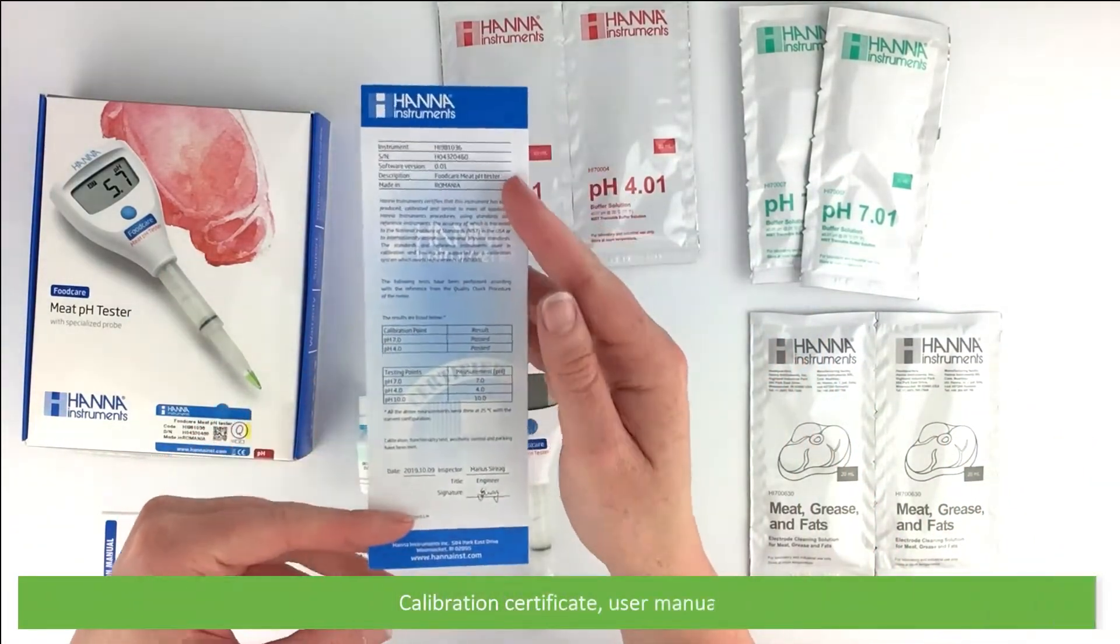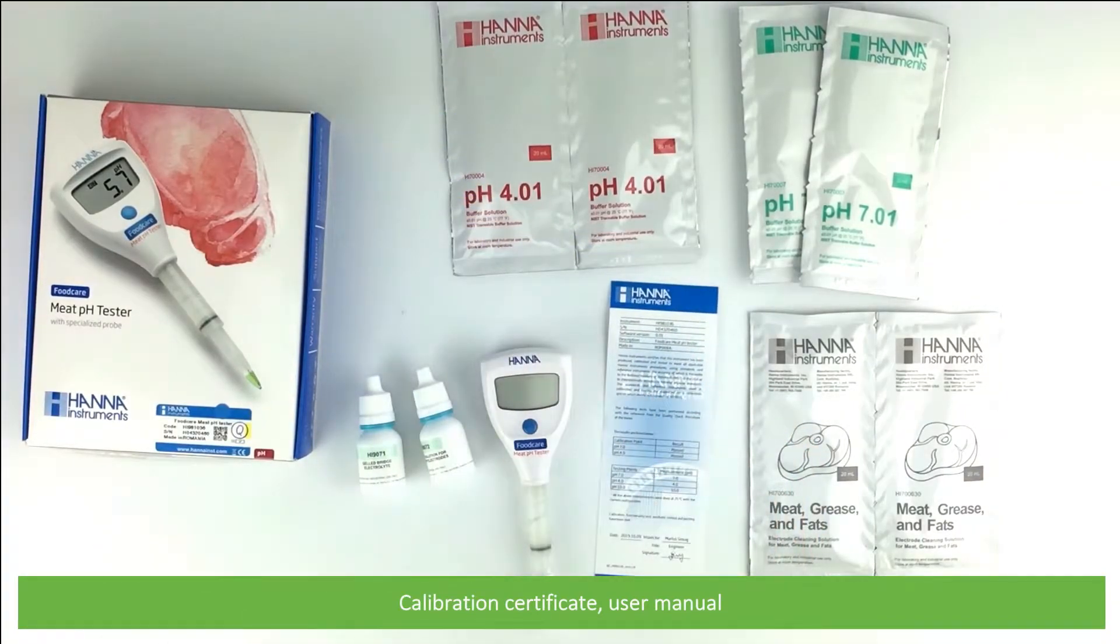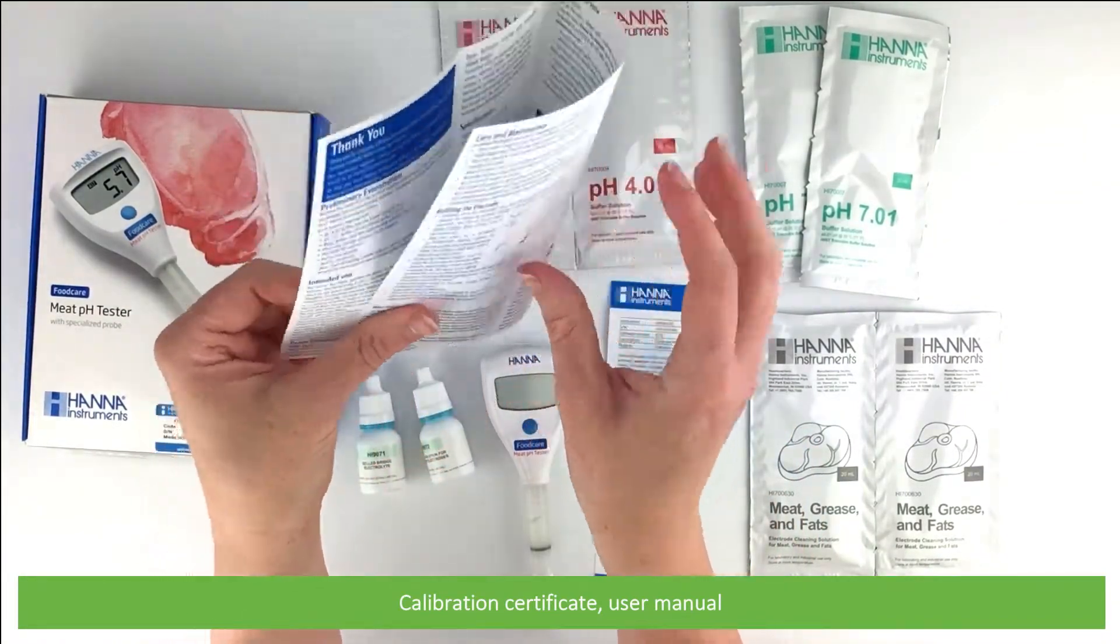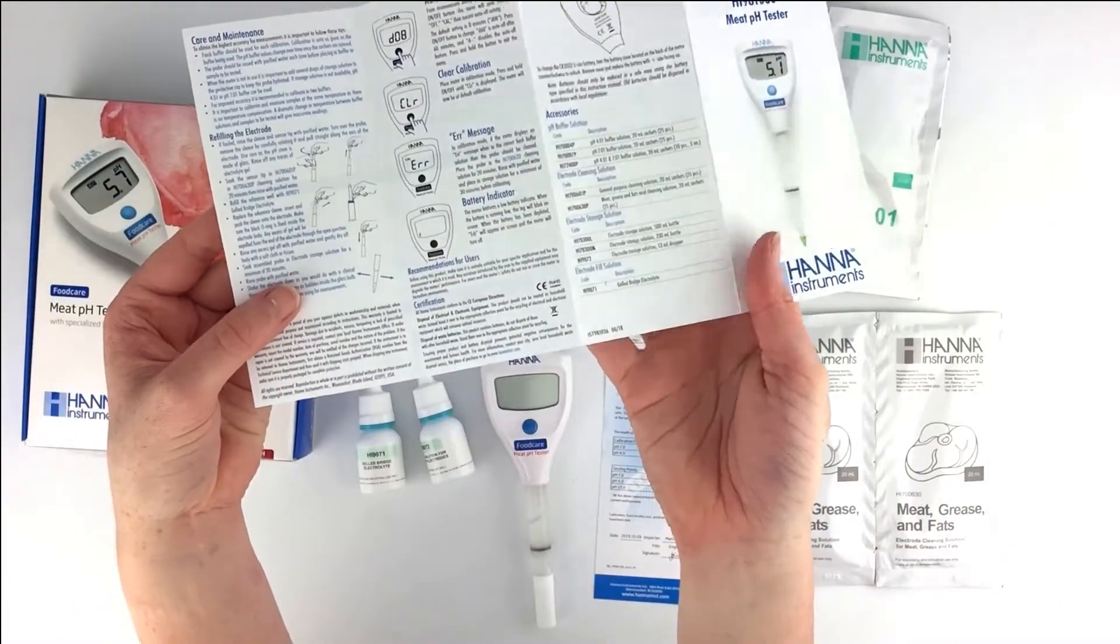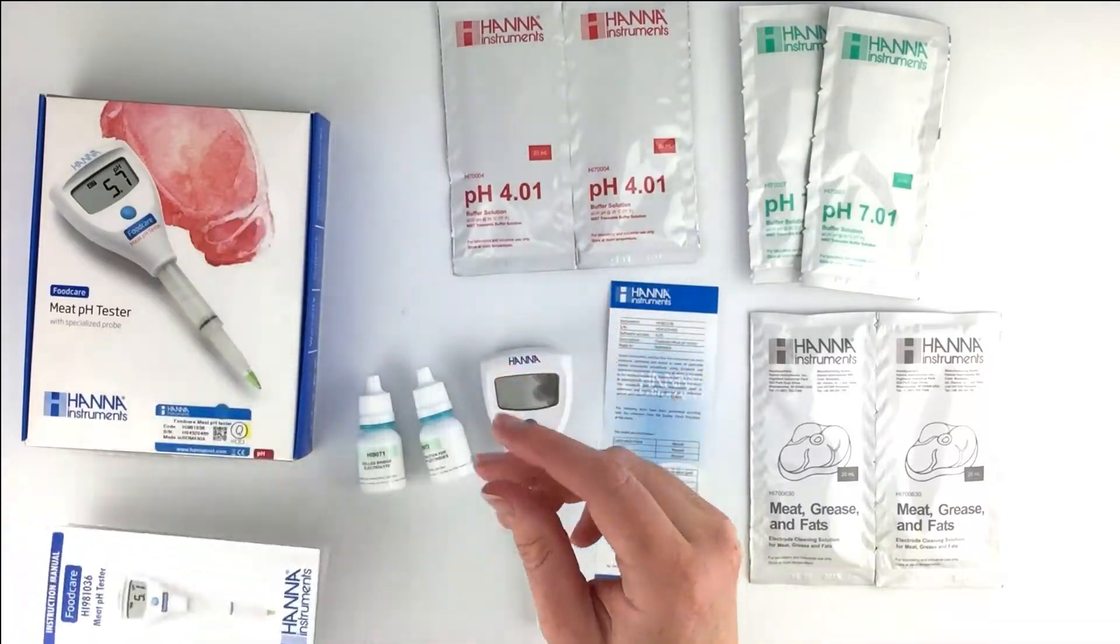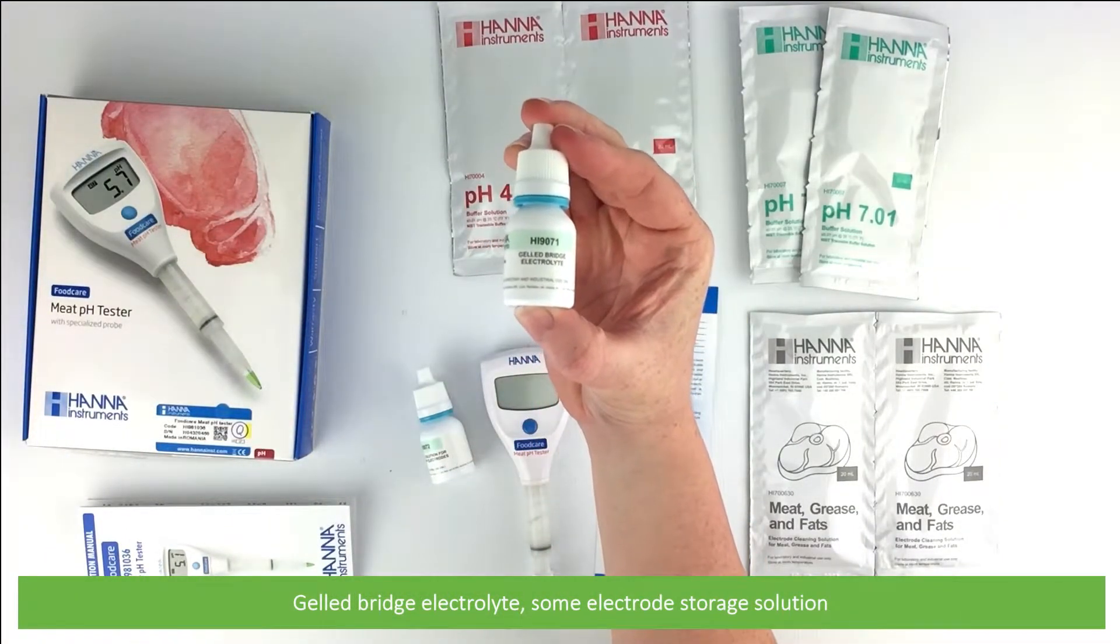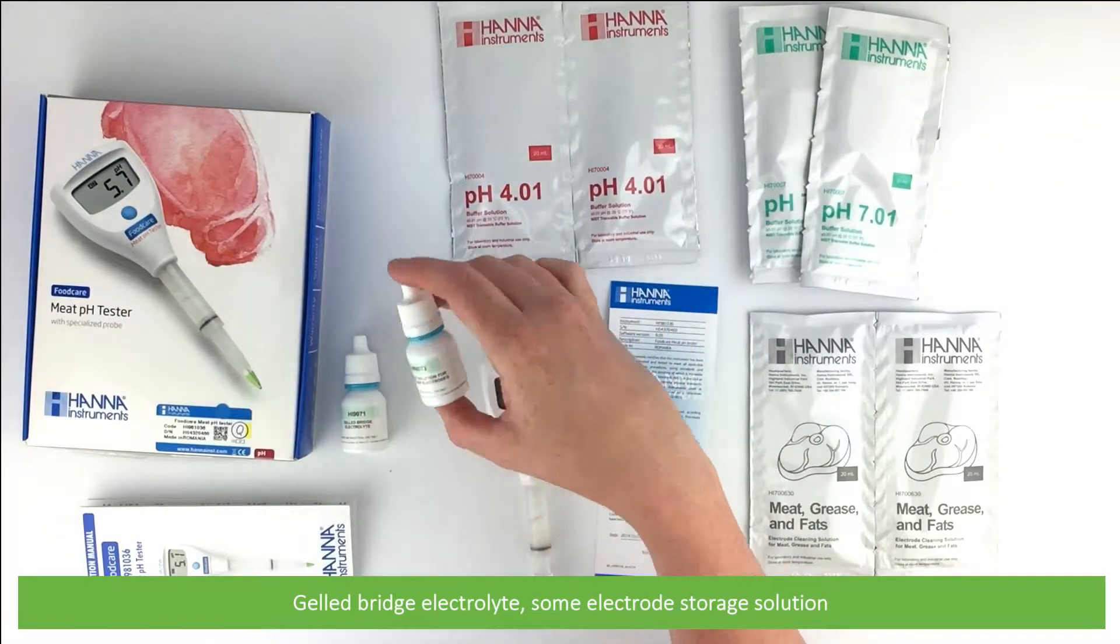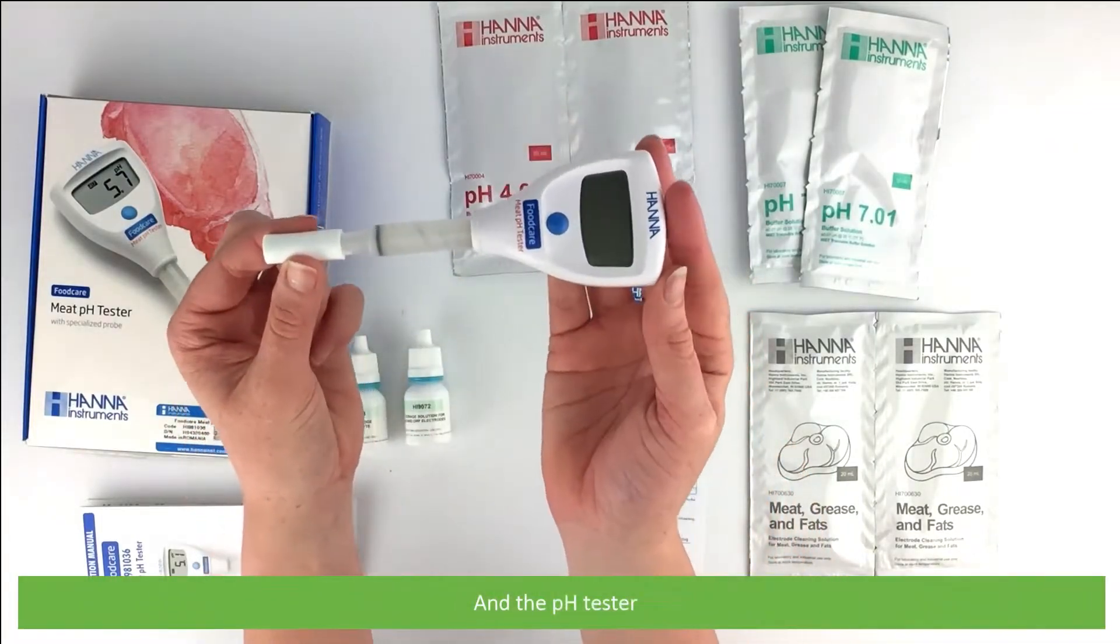A calibration certificate, user manual, gelled bridge electrolyte, some storage solution, and the pH tester.